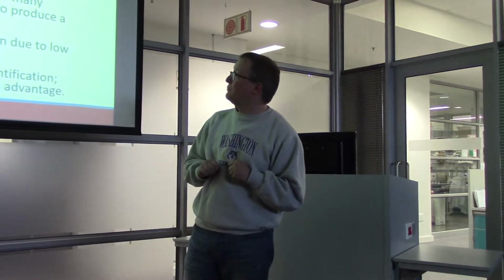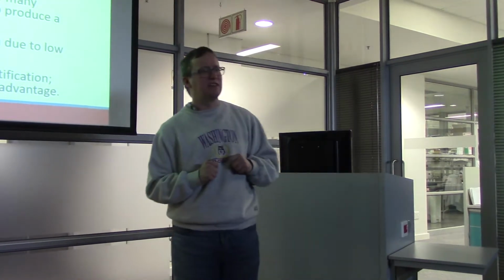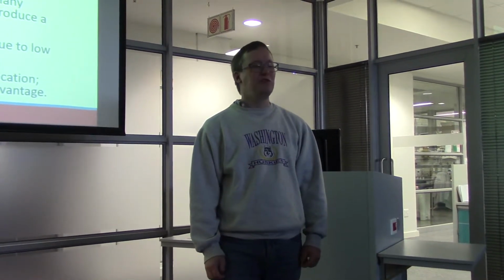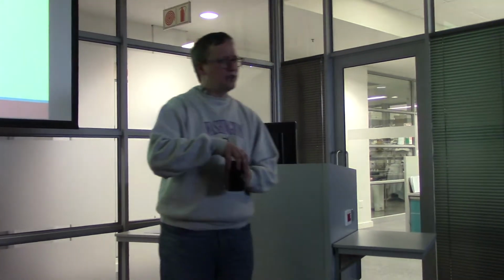Every proteomic sample contains too many peptides for the mass spectrometer to produce a comprehensive set of MSMS scans. So at this point, you probably should be kind of rolling your eyes at Professor Tabb and saying, no, really, come on. If you shoot one protein in LC-MS/MS, shouldn't you be able to see all peptides from that protein in a single experiment? I mean, one protein, how difficult could that be? You might think that. You might think that.